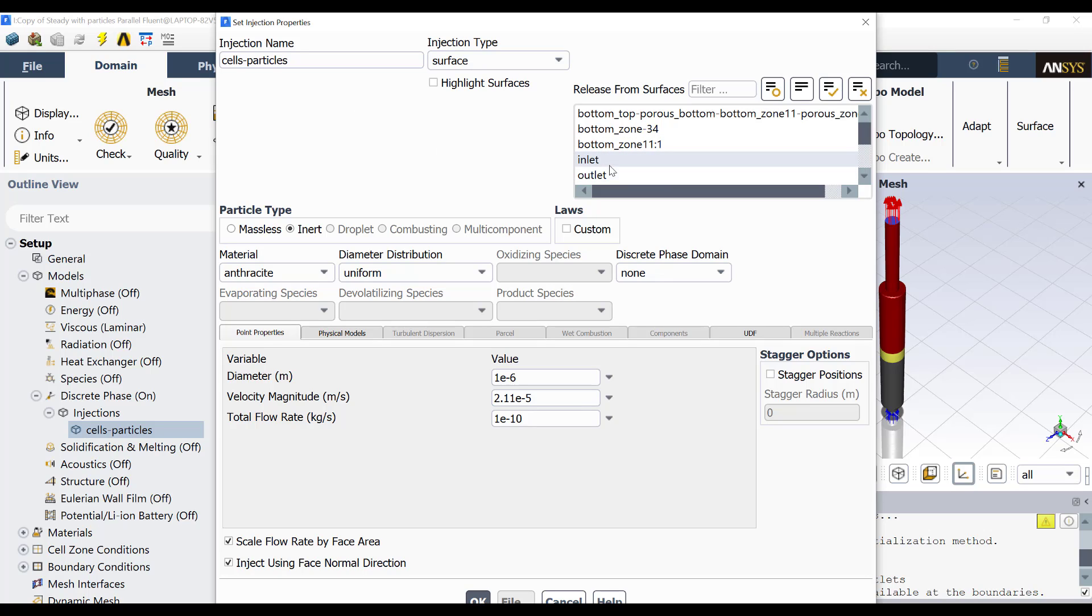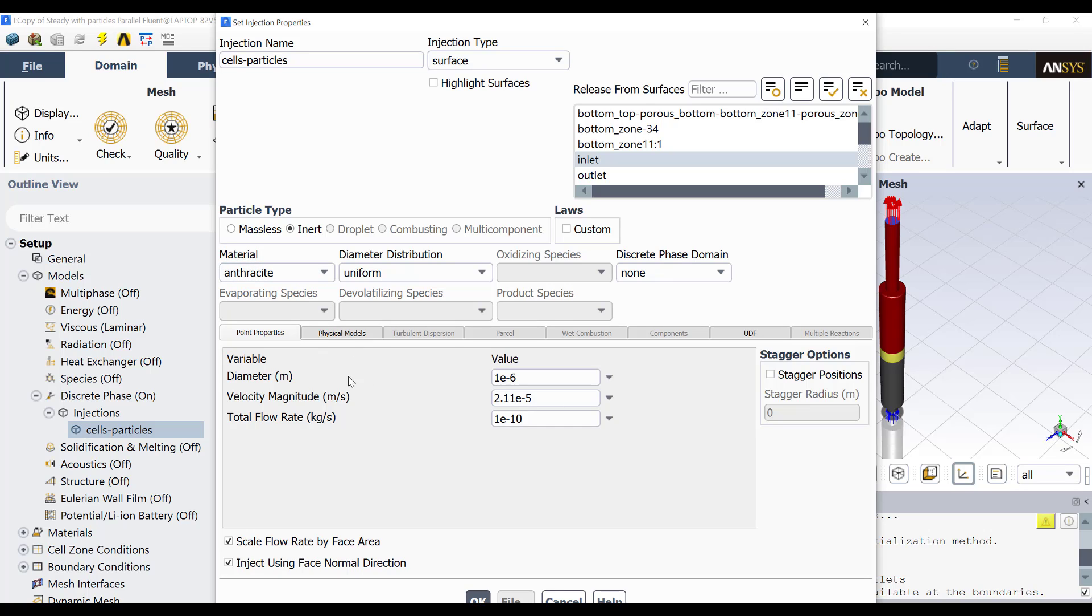The particles are injected from the inlet. There is an injection type from surface. These are inert particles. Then there is no reaction among the particles and the fluid flow. The material in this case is just for sample purposes. It is anthracite.